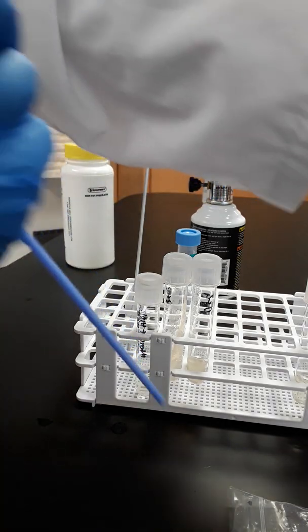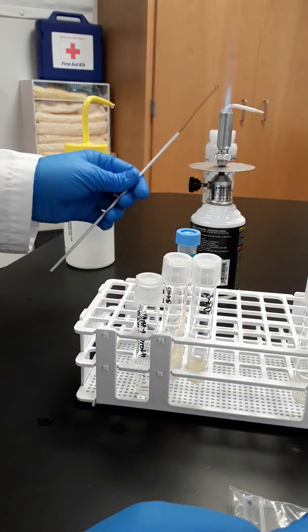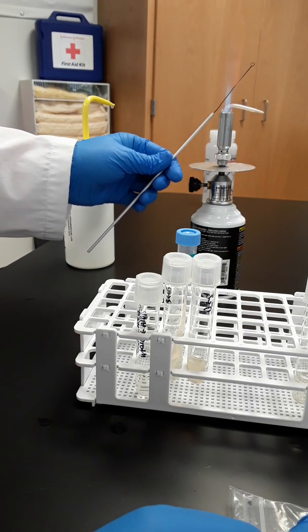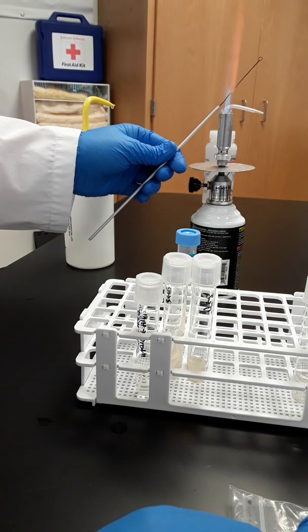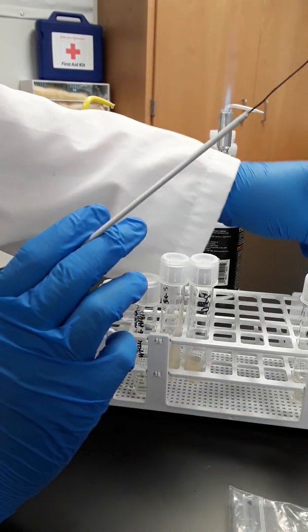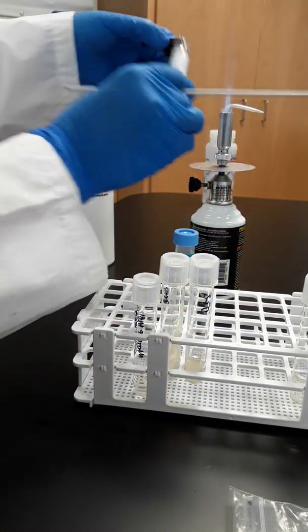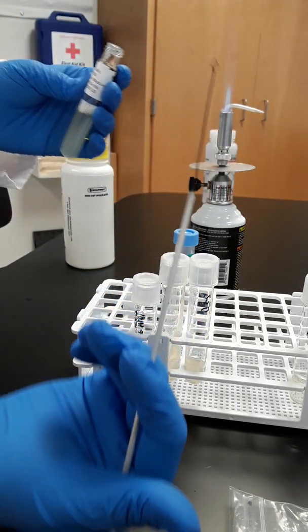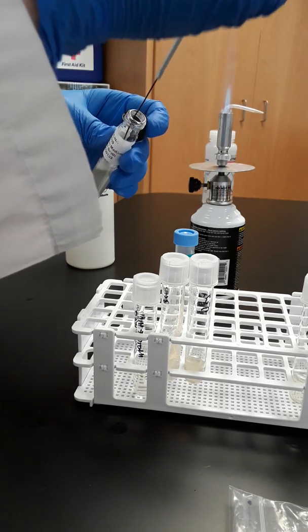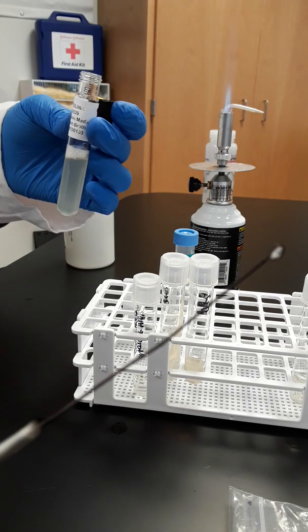You would get a fresh one for each one of your cultures. I'm just pretending that that one was sterile. Okay, and the same thing with the loop. You would flame, flame, flame, flame. Make sure that it's out of the flame for like 10 to 20 seconds. So you wait. And then you would just dip it into the broth. Flame, flame, flame, flame. Waiting 20 seconds feels like a long time, but it's okay. And then just dipping it in. As long as it has touched the liquid, it's totally done.